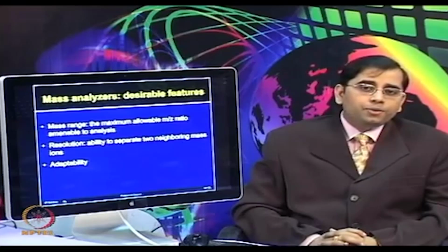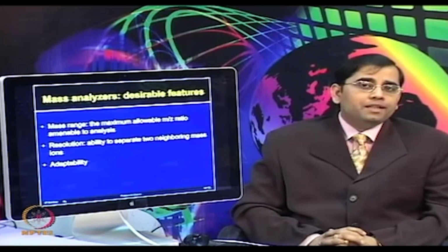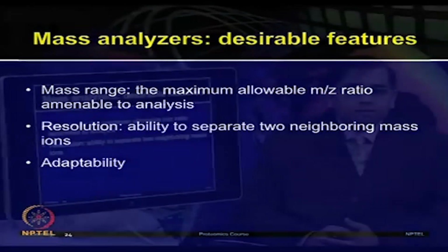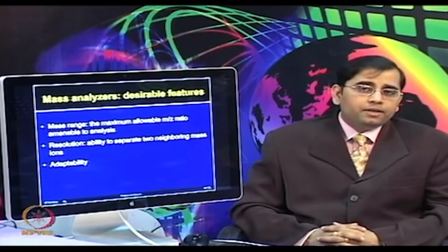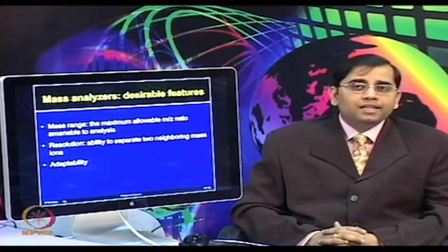So, if you have a higher value, that will be useful for analysis of the high mass compounds. Resolution, or the ability to separate two neighboring mass ions. So, how well the mass of interest can be separated from the other species describes mass resolution.